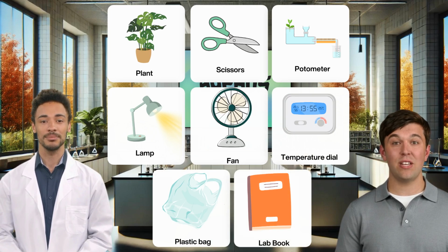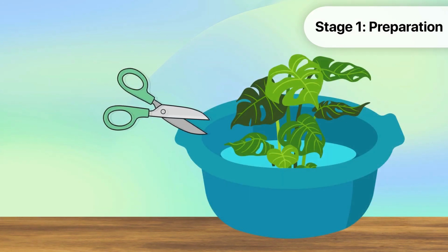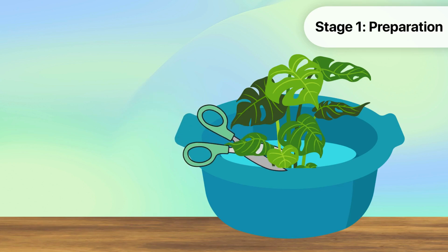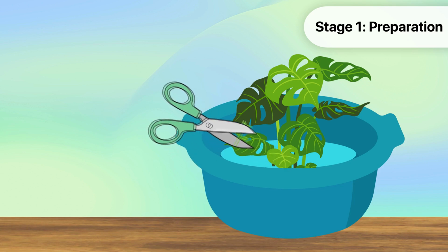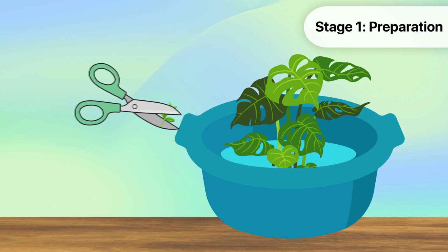Great. Let's get started. For this practical, it's essential to maintain a precise setup to ensure reliable results. So let's go step by step. First, we need to carefully cut a shoot from our chosen plant. This must be done underwater to prevent air from entering the xylem, which could disrupt the water flow. Make sure to use sharp scissors and handle the plant delicately to avoid damage.